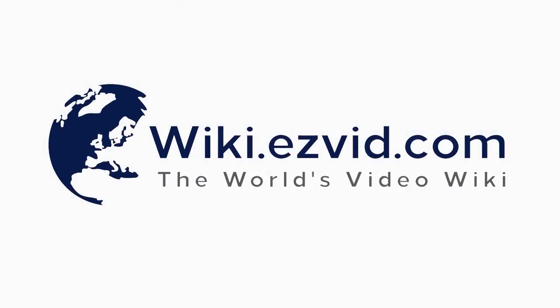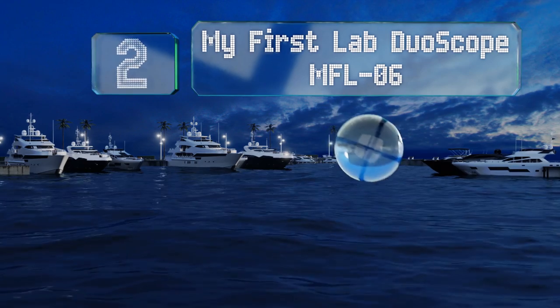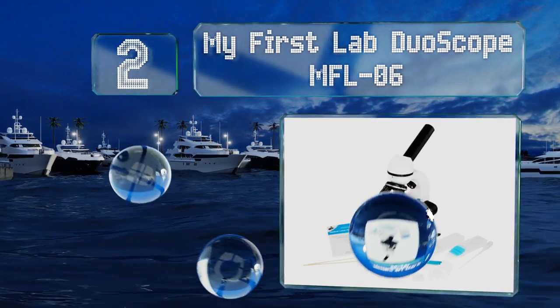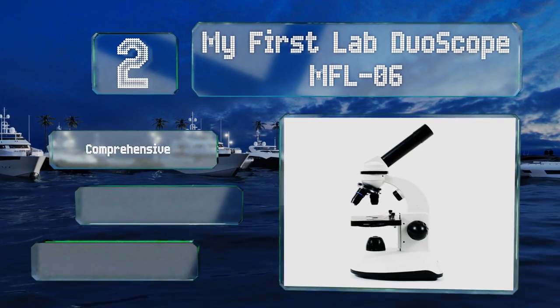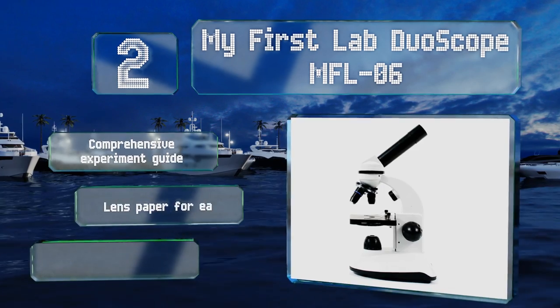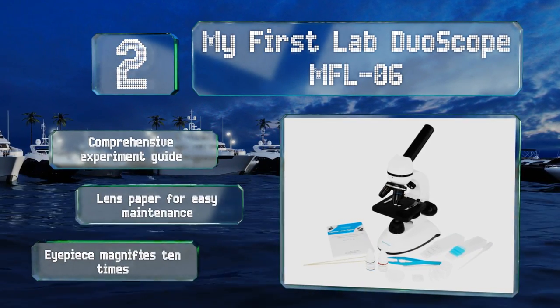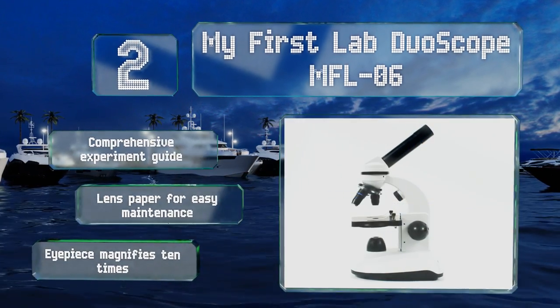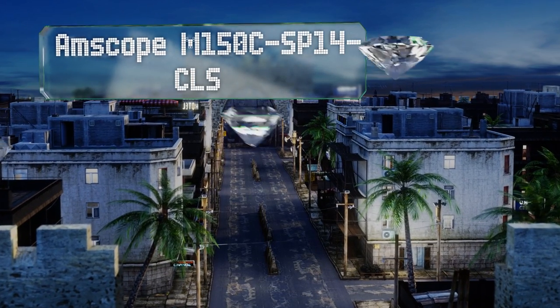At number two, the My First Lab Duoscope MFL-06 uses real glass optics to take the view of your subjects to an impressive 400 times. Its stage light allows you to view three-dimensional objects with the same ease that you enjoy traditional slides. It features a comprehensive experiment guide, lens paper for easy maintenance, and an eyepiece that magnifies 10 times.